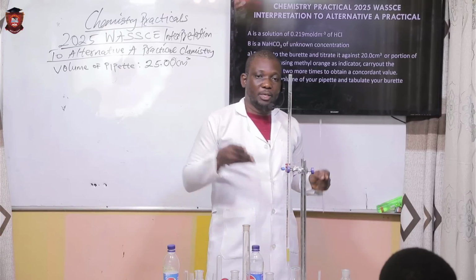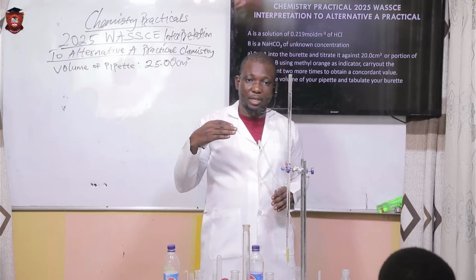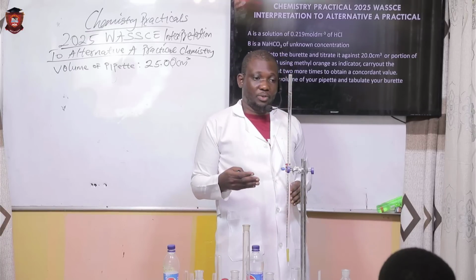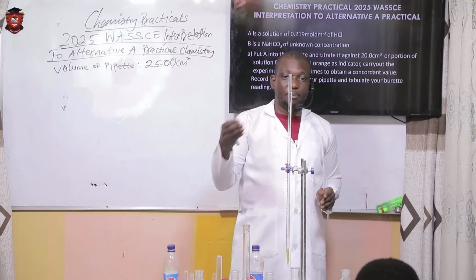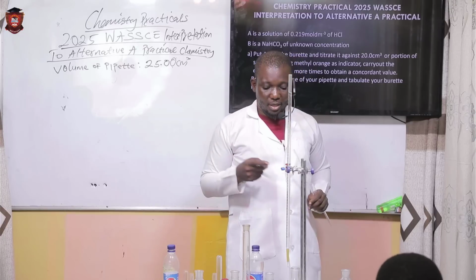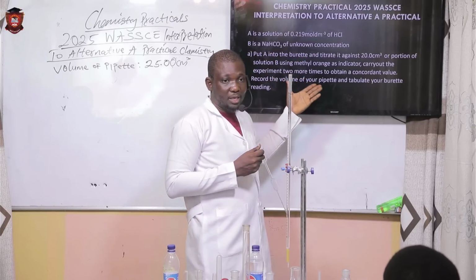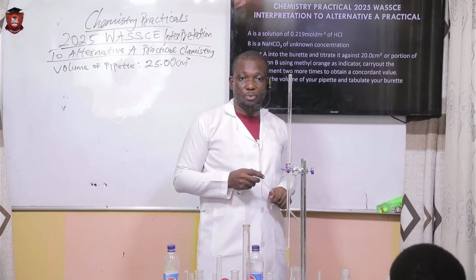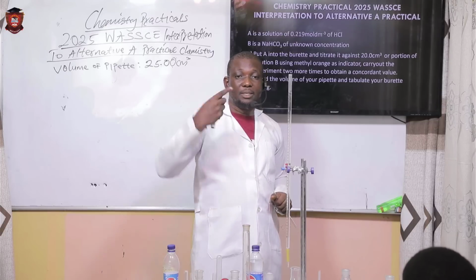This particular question depends on whoever will be piloting the chemistry in a particular center. So as far as this video or this class is concerned, it doesn't all depend on this video. It still depends on the chemistry teacher, because whatever we are using here in this video may vary with the center. So please, a disclaimer here: whatever we're using here as titre value or endpoint is not fixed, because these things can vary from school to school, but the principle still remains the same.